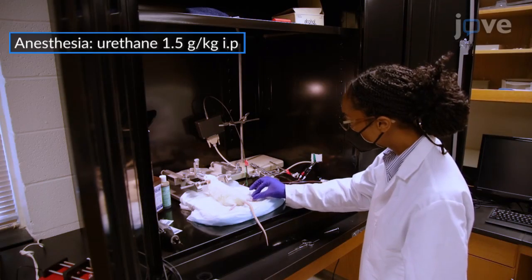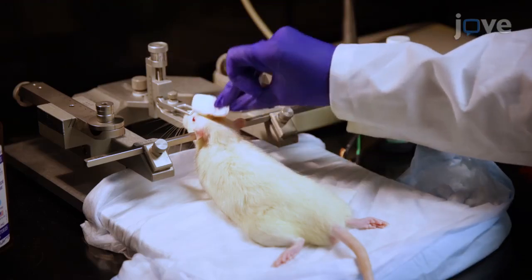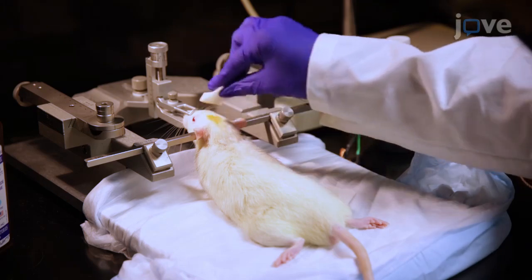After confirming a lack of response to pedal reflex, clean the scalp of an anesthetized rat with three sequential iodopovadone and 70% ethanol scrubs.